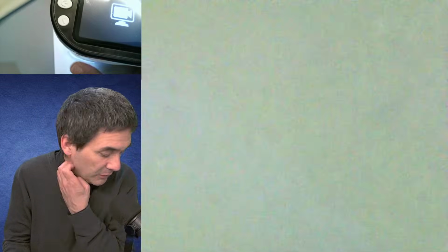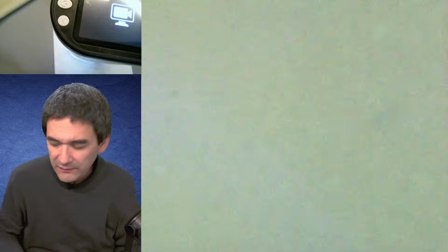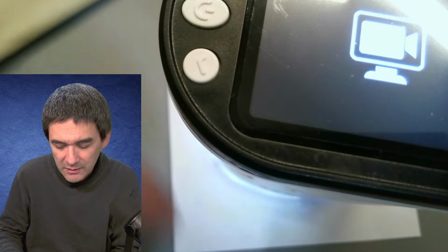So let's do the following. I want to check if blood is a possibility as well. For this reason, I'm going to use a new little device that I got. I need just a second, the slide is stuck here. And here it is. Let's put this up again.